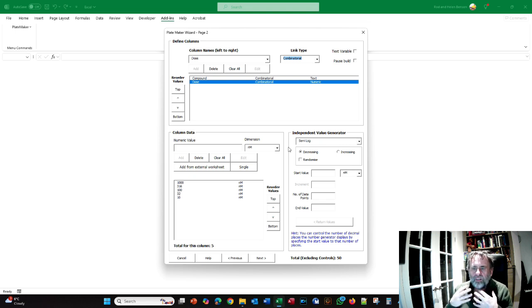So in other words, the drawback of the combinatorial link, of course, is that it's a repeating pattern. But let's imagine, as can be quite common in a dose response drug experiment, you might have some drugs that are intrinsically more potent than other drugs, so you want to use them at different doses. The linear link allows you to make those sort of adjustments.